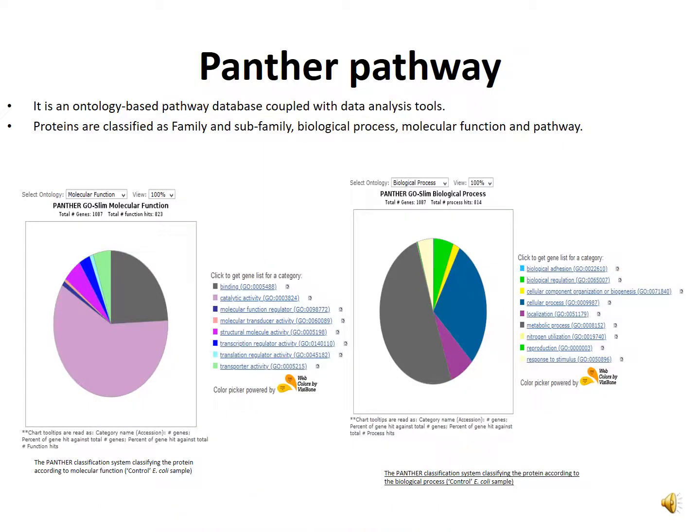Let's talk about the Panther pathway. It is an ontology-based pathway database coupled with data analysis tools. Proteins are classified by family and subfamily, biological process, molecular function, and pathways.